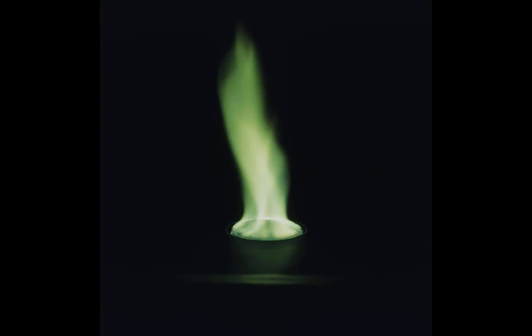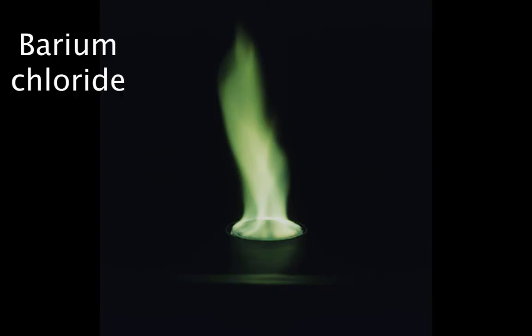This is actually how fireworks work — the different metals burn different colors in fireworks, and that's how you get the reds, greens, whites, and purples. One metal you did not see in the lab was barium chloride. When you burn any metal chloride you're focusing on the metal ion and the color it produces. For Ba²⁺, it burns a yellow green color.